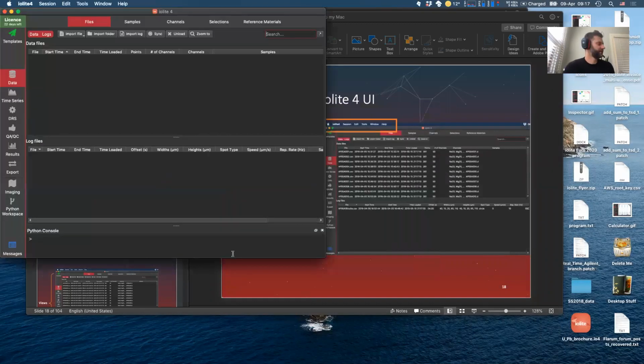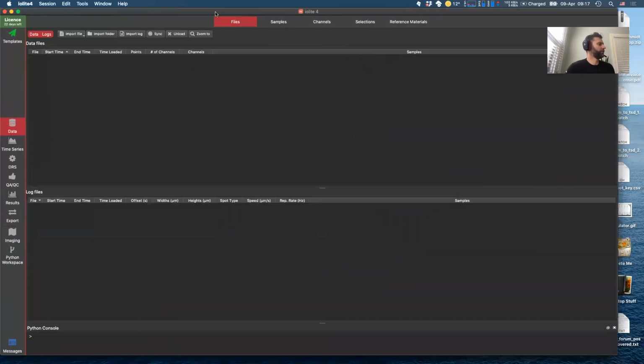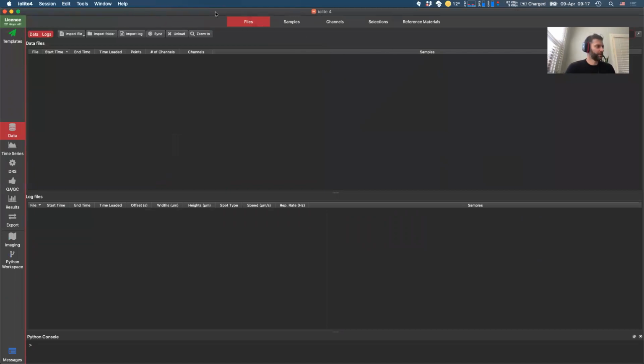So feel free to follow along with me for this webinar. I will say though that there will be times when I might go a little bit fast for some of the beginners. If that's the case, feel free to just let it go past you. And we're recording it, and when we put the video up, you can always catch up on what we did using the video. So don't feel stressed about trying to keep up if it's going a little bit too quickly. Hopefully we won't go too fast.